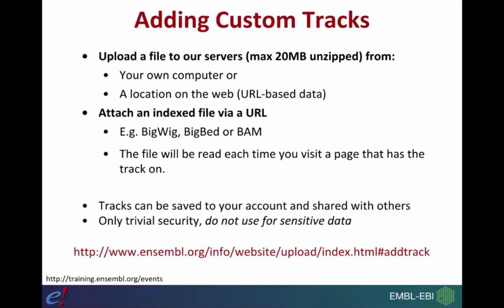You can also create an Ensembl account, and if you have an account, this enables you to save your tracks and share them with others. And finally, just to say that you can use this, of course, but be aware that we only have relatively trivial security. So do not use this functionality of adding custom tracks for any data that is sensitive, such as data that contains patient identifiers.